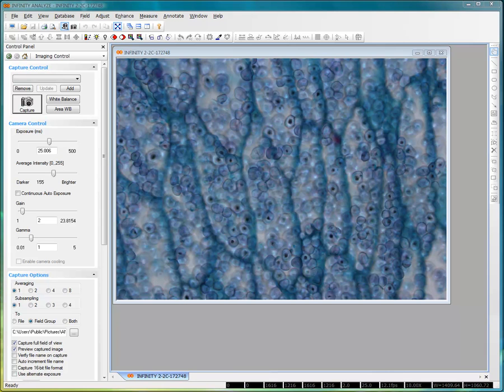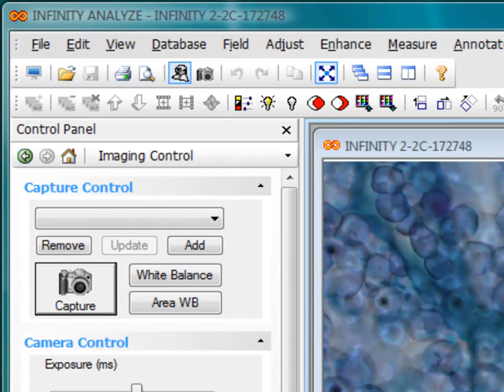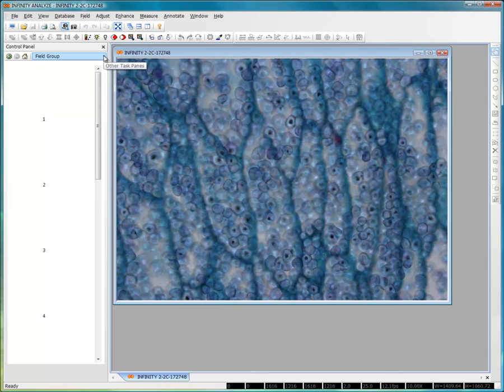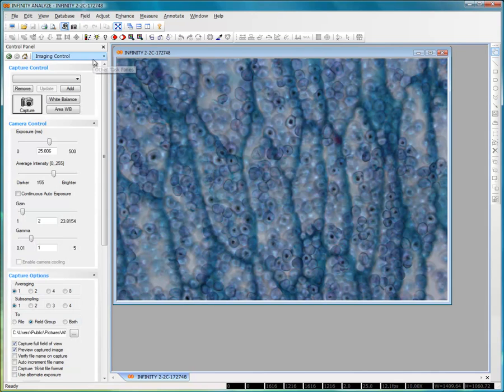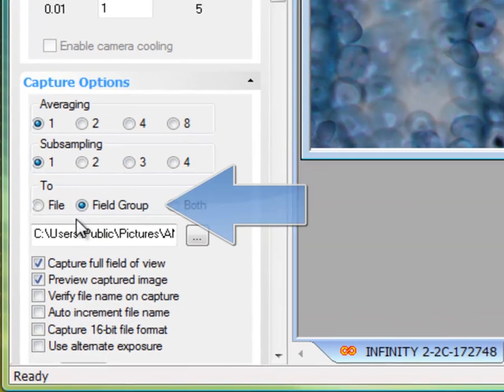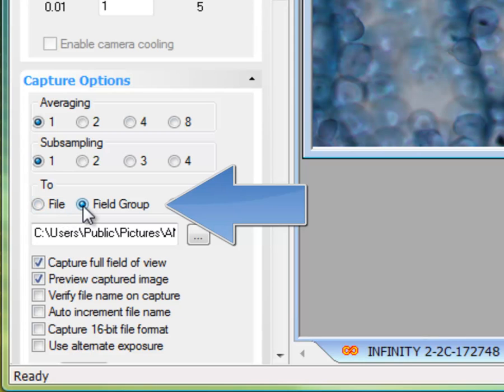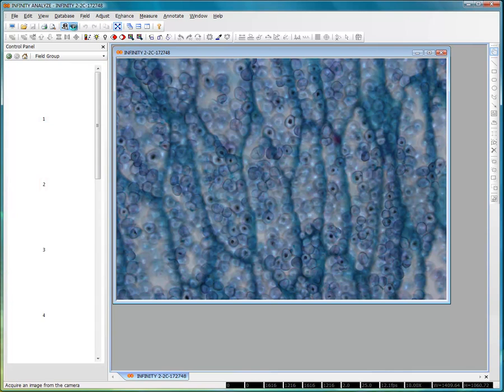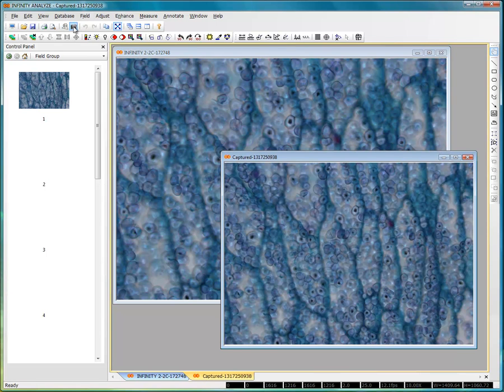Within Analyze, the field group is used to hold copies of images for processing. Images can either be directed into the field group as they are captured from the camera, or they can be added into the field group by importing them from disk or from any image file opened within the program. To capture images directly from the camera into the field group, look under the capture options panel and see how the field group is selected as the destination. I'm going to go back into the field group and capture an image from the live preview. Notice how the image appears on screen, and because we've selected the destination as the field group, it's now there as image number one.